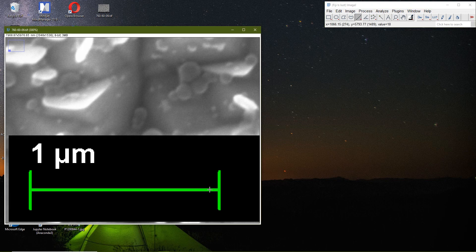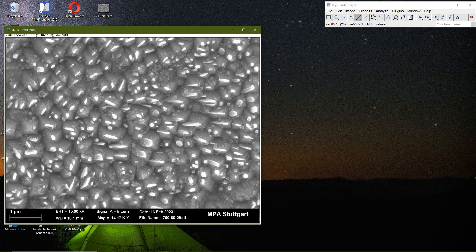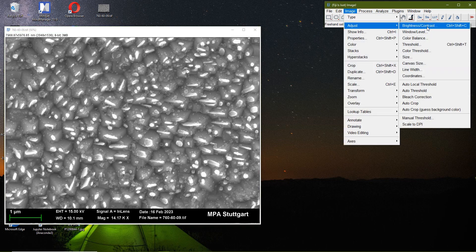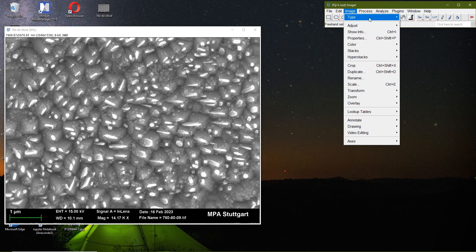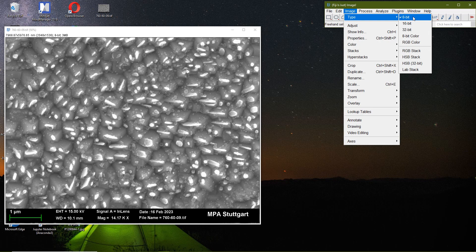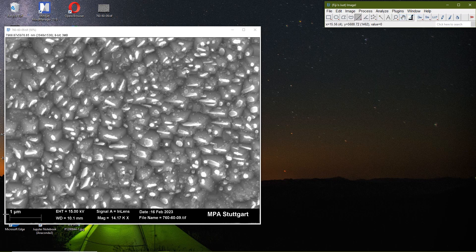After setting the scale I remove the line selection, then press Shift and scroll back to see the whole picture. Now the scale is set. I go to Image > Type > 8-bit to convert it to grayscale. When I click this, there will be no color and the image turns gray.